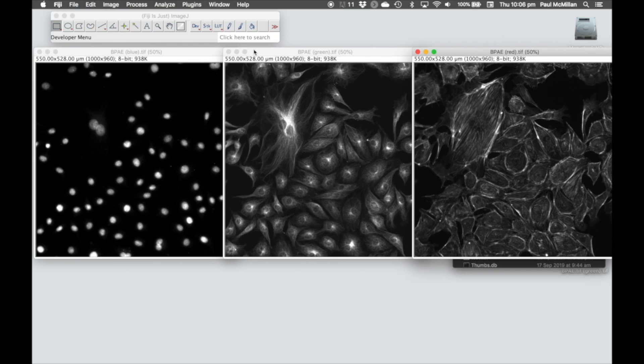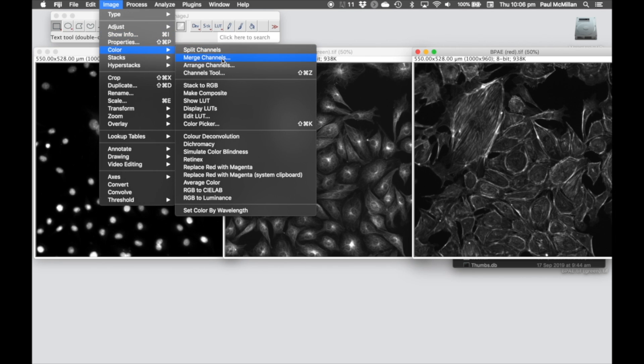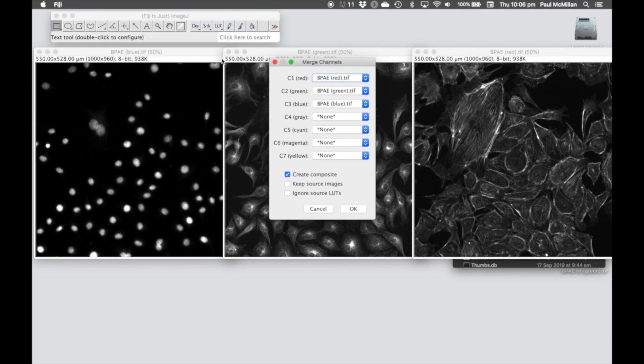In this case we want to merge these channels back together again. To do that we're going to go to Image, Color, Merge Channels.